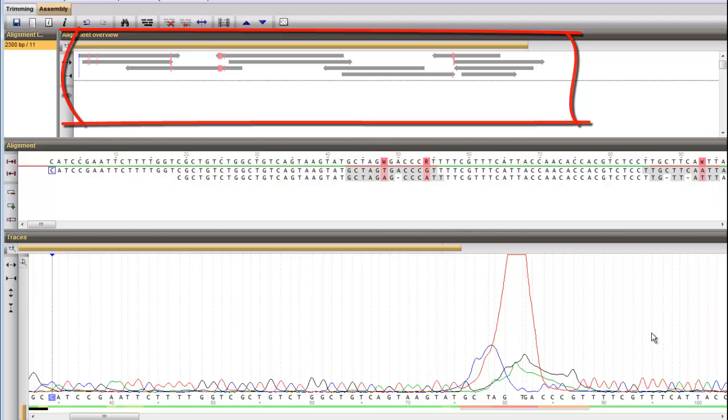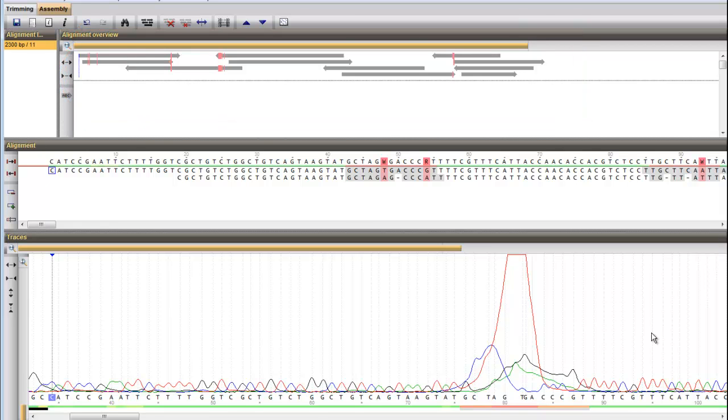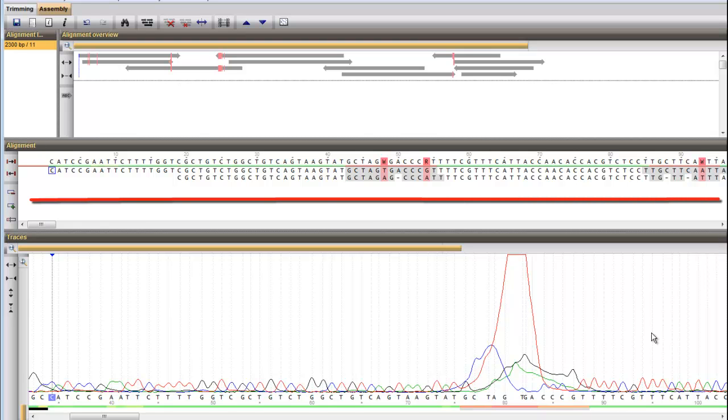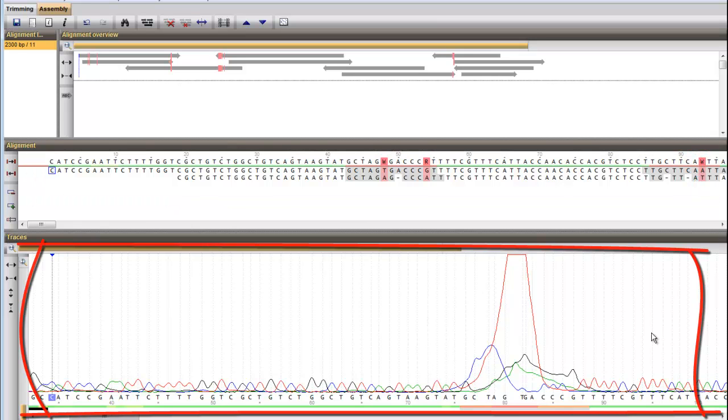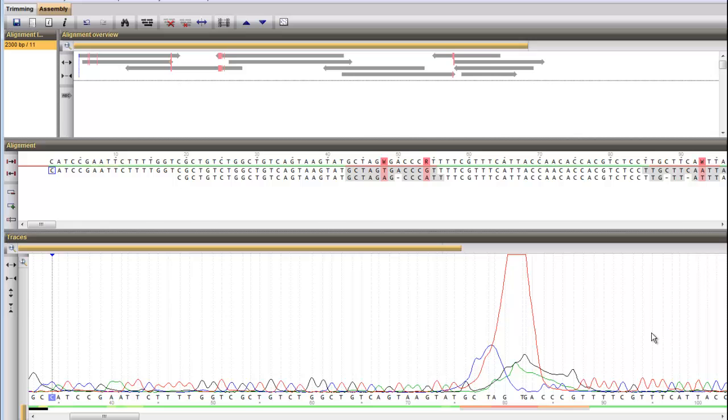The top panel graphically outlines the position and orientation of the separate partial sequences in relation to the consensus sequence. The middle panel zooms in up to nucleotide level and the panel below shows the selected raw trace file. These three panels are synced.